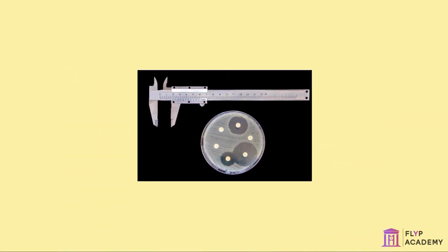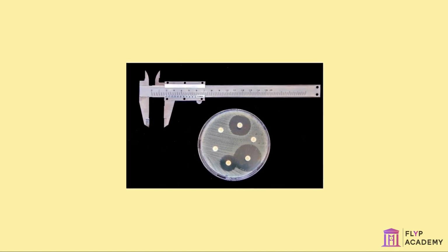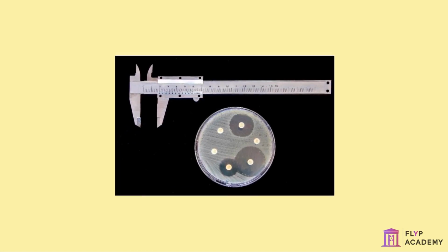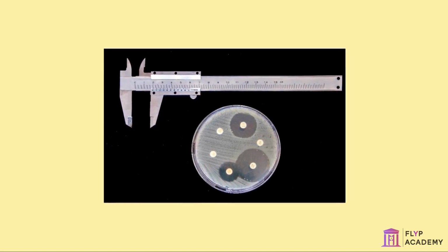Bacterial cultures can be used to test the effectiveness of antibiotics or disinfectants. Small discs of paper are soaked in the substance and placed on the agar. Bacteria will not grow around the discs if they are effective at killing them. The largest clear area indicates the most effective substance.